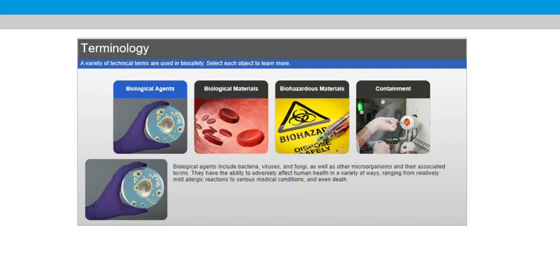Biological agents include bacteria, viruses, and fungi, as well as other microorganisms and their associated toxins. They have the ability to adversely affect human health in a variety of ways, ranging from relatively mild allergic reactions to serious medical conditions and even death.